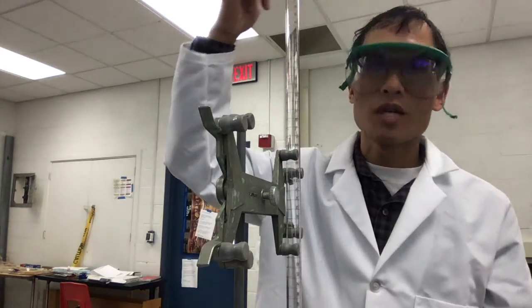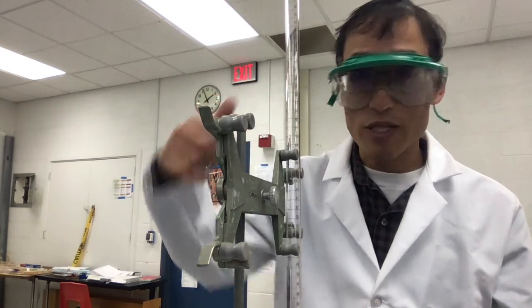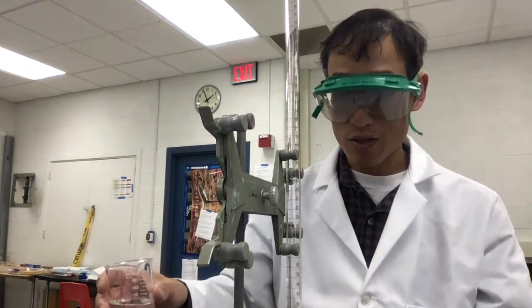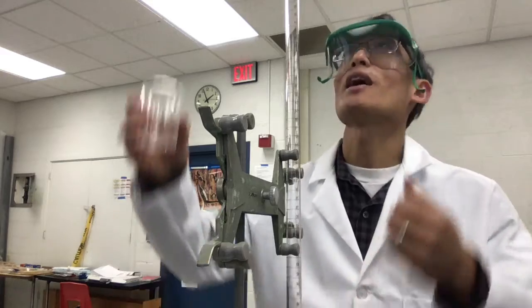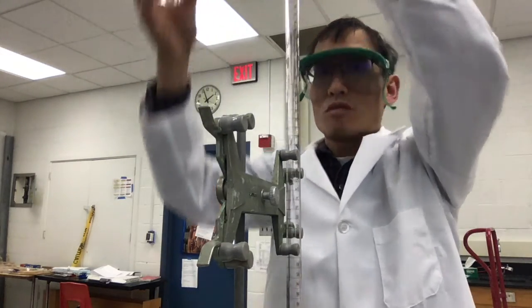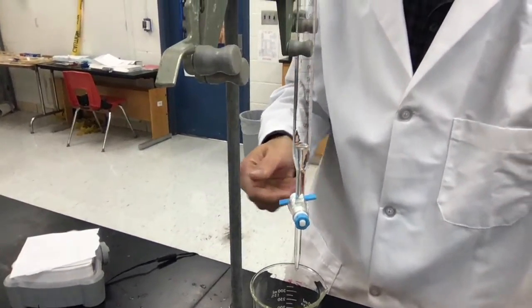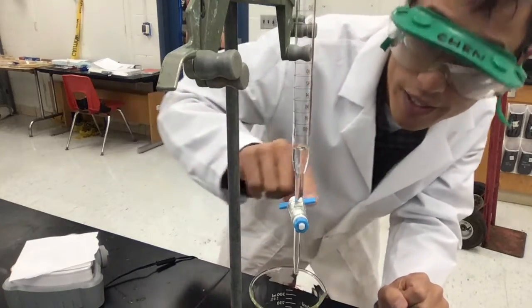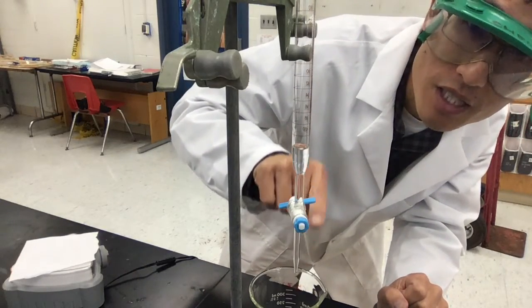And now what I'm going to do, after the second rinse, is flush it again. But this time when it's coming through, I'm going to close the stopcock. So there we go. Run it through a little bit. I'm going to close this like that, okay? And if you do that right, you should have no bubbles in this area here.